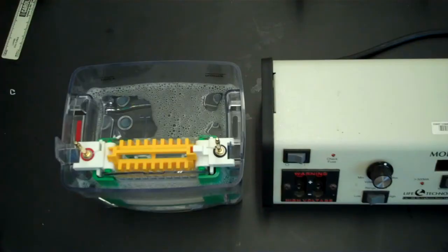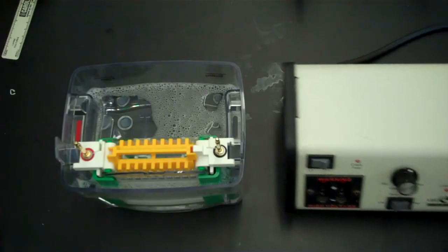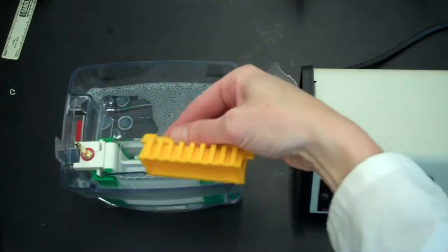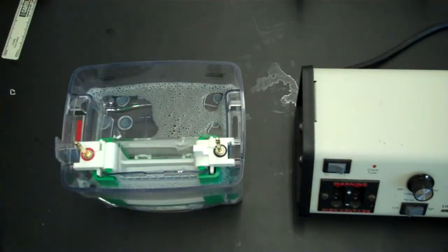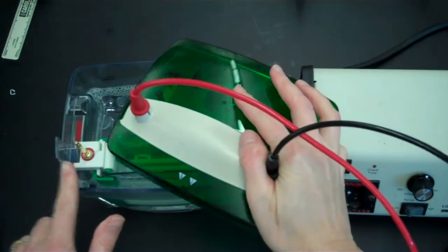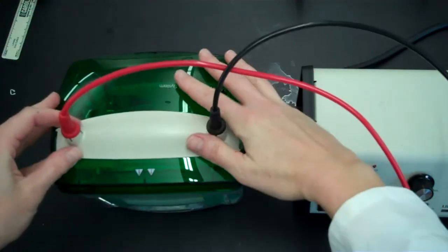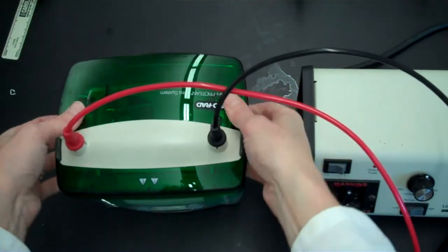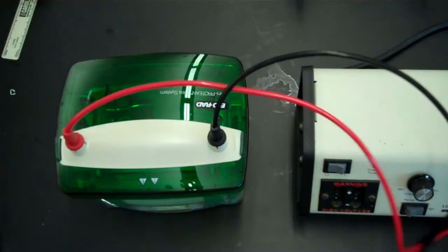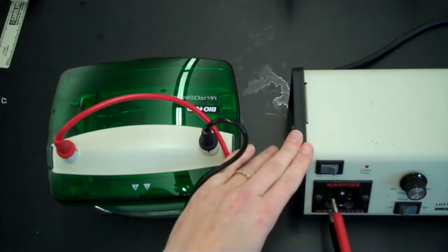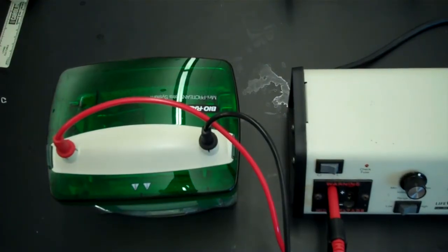Once all your samples are loaded, you are ready to turn on your SDS page. And so the first thing that you are going to do is remove the loading guide. Next, put on the top, aligning red to red and black to black. It should snap on nicely. And then you are going to put the leads into your power supply. Again, red to red and black to black.